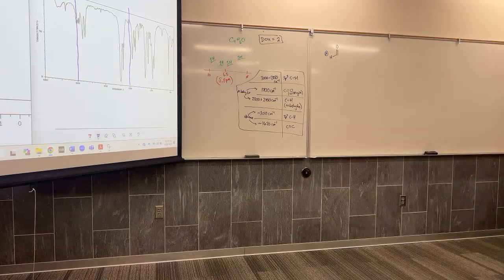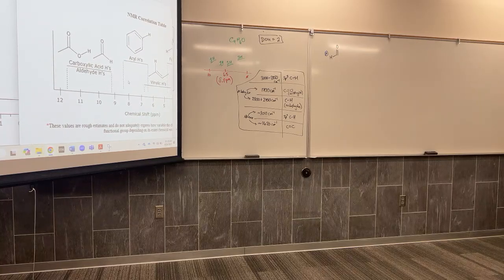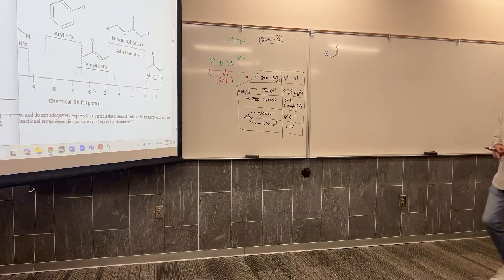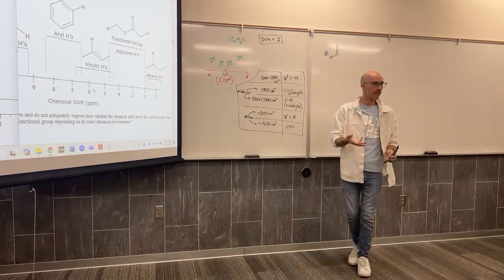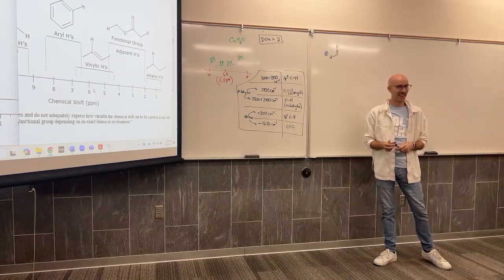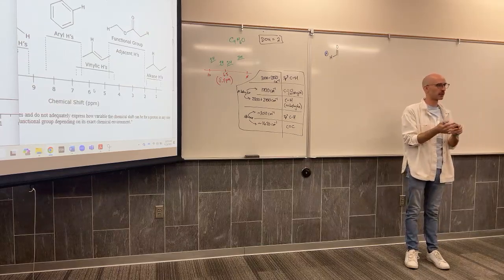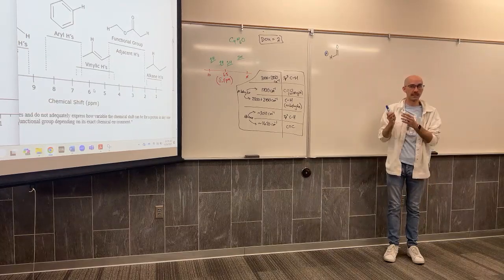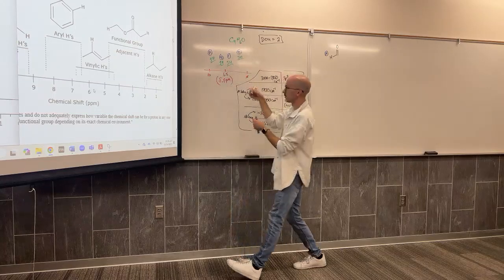two vinylic. 2 vinylic. Is it really vinylic though? Because when we look at our vinylic region, yeah, the vinylic region kind of goes from 4.5 to 6.5, 7-ish. But it's also butting up into the aryl region. So how would you know it's an alkene, vinylic? How do you know it's not aryl, an aromatic ring? Not enough carbons for the aromatic ring. And we understand that the chemical shifts are compounded by being in different groups, like perhaps an alkene hydrogen also being adjacent to a carbonyl. That's going to shift its signal even further to the left. So 2 vinylic hydrogens.